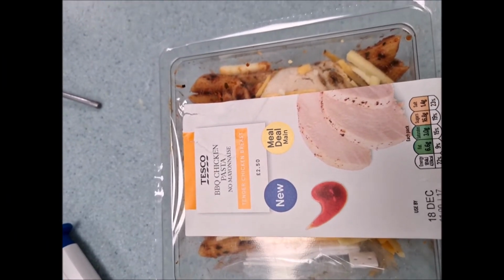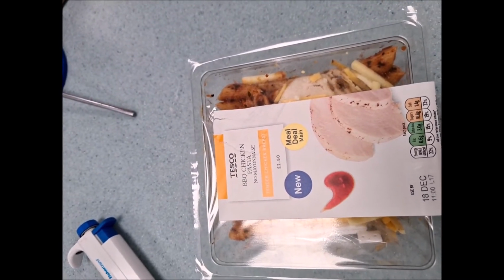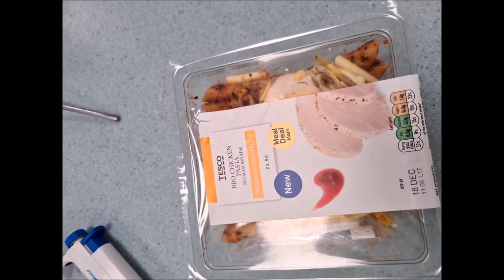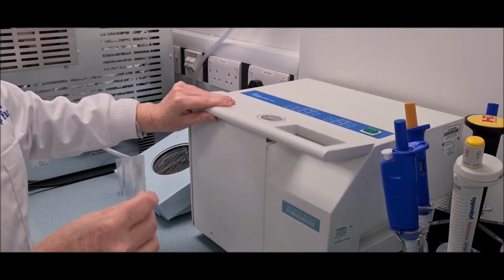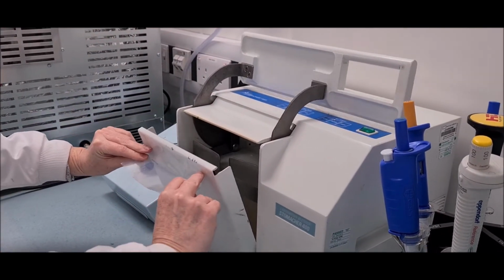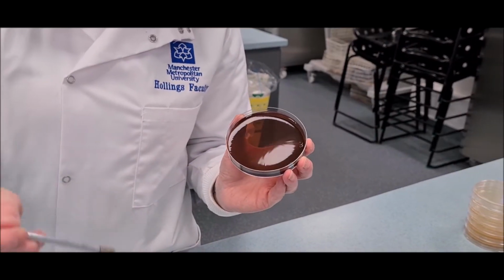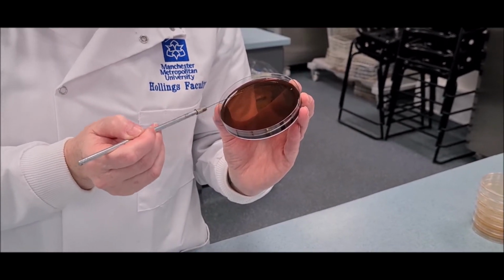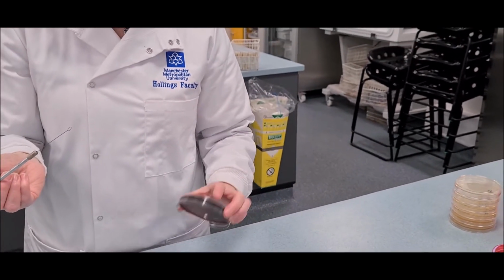Where small numbers of bacteria are expected, or there is a possibility of the presence of fastidious organisms, an enrichment process may be required. This enrichment media contains nutrients to encourage microbial growth to detectable numbers. Samples tested for Salmonella species, for example, are incubated for 24 hours in enrichment broth, such as Salmonella 1 broth, prior to inoculation onto selective media. After incubation of the enrichment broth, a loopful is then streaked onto the selective media, which is incubated at the required temperature and time before observation.